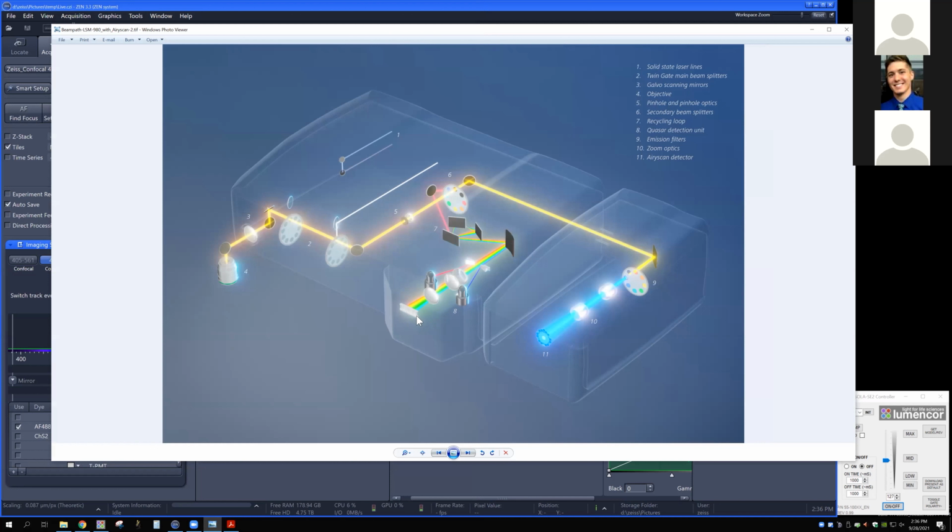The spectral detector here has 32 different elements spread across this entire spectral range. When we send light to each of these elements, we can pick up and separate those just based on the properties of the detector itself. This is what really gives us the power to do spectral work and really fine control over exactly what wavelengths are reaching this detector.